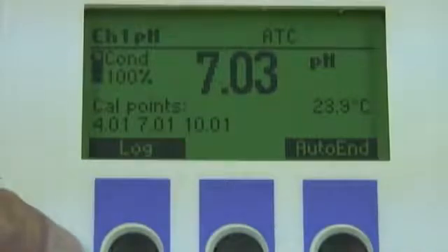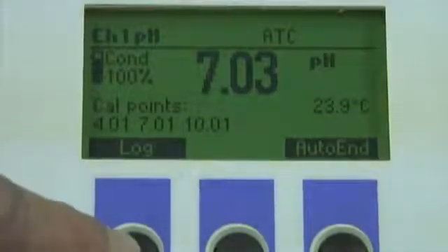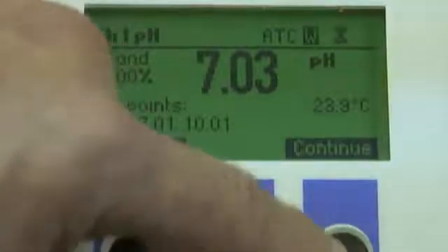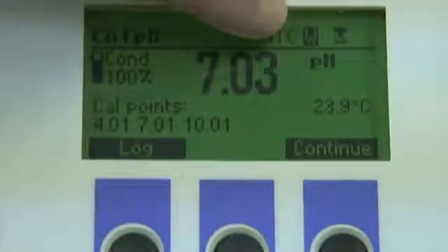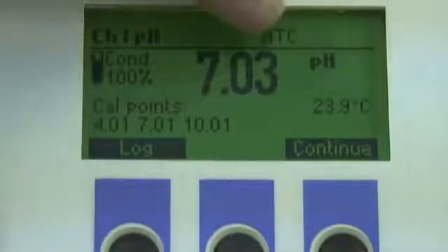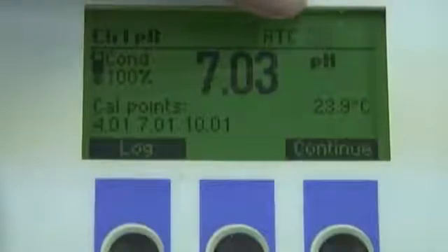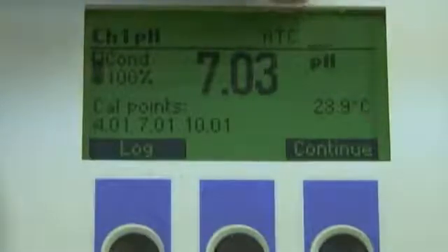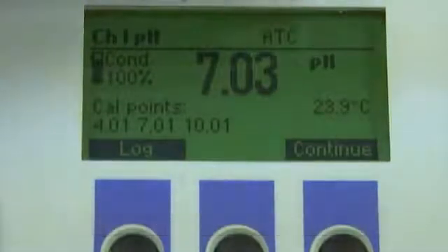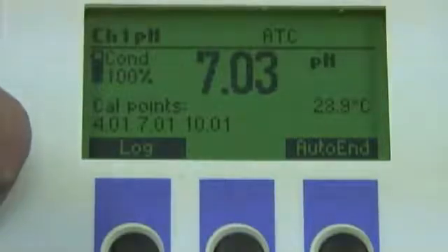If I want to record the current reading, I simply hit the log button. Another feature we have is auto-end. When I push the auto-end button, it tells me to wait. We see the stability indicator, and once the 'W' disappears, 'AE' will flash and the reading is locked in. This won't change regardless of the solution I put the probe into, and it's useful with gas-sensing ISE where readings will continually change. I'm going to hit continue to go back into meter mode.